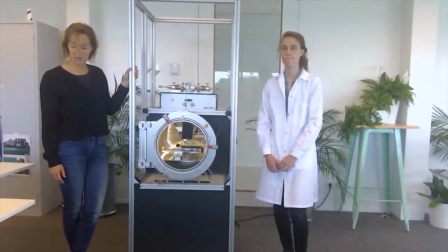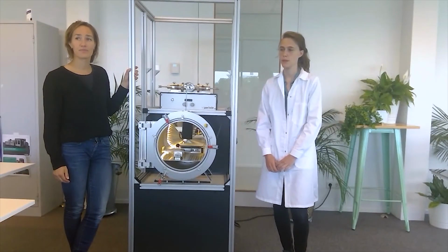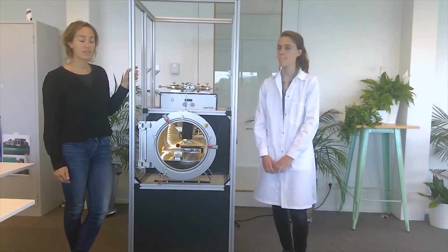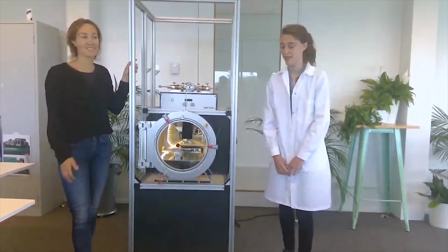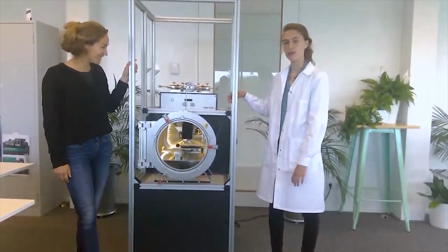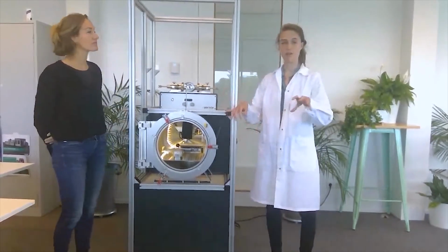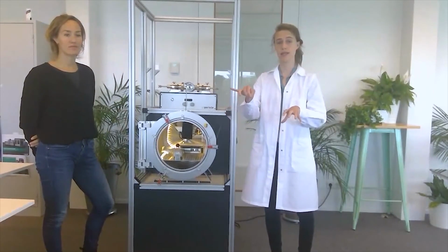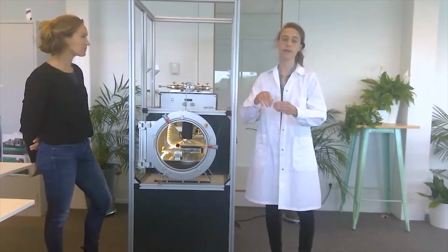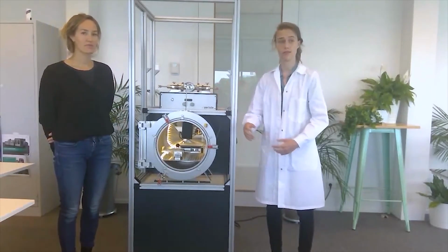Second question. How do you align the nozzle with the substrate? Good question. Attached to the nozzle we have a microscope camera. With this you can, from the interface, see where the nozzle is and align it exactly where you want it to be and see where the pattern will be. And then we know, of course, exactly the distance between the camera and the nozzle. And then you can print exactly where you need your material to be.